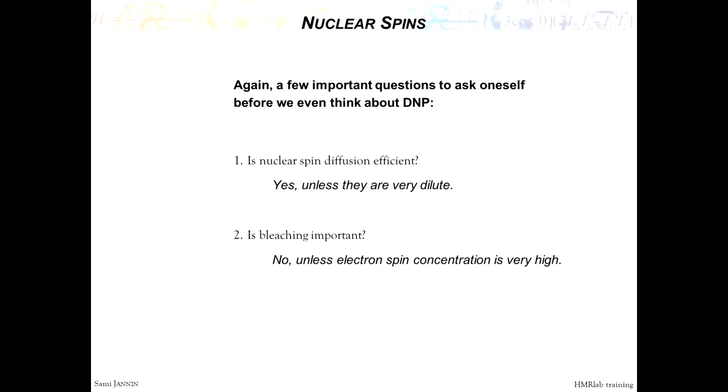Yes, we're happy when we can have the shape of the microwave spectrum. That's about what we can do. But yeah, if you increase radical concentration, it gets faster. If you have too much radicals, it degrades because your lines get too broad. If you don't have enough radicals, it's too slow. And you get out of the spin diffusion regime at one point and DNP collapse. So everything behaves as it should, but really qualitative.